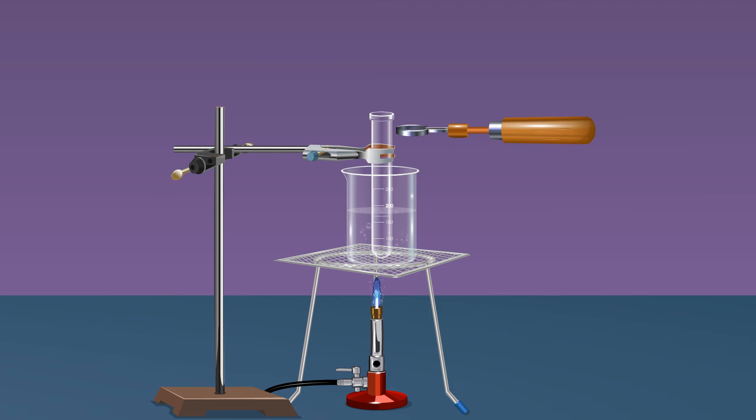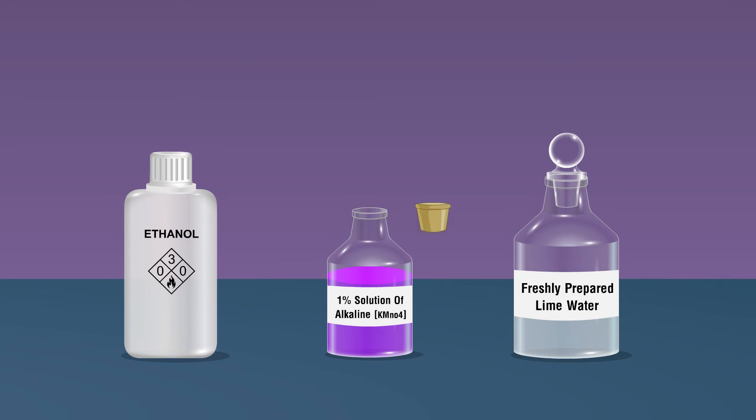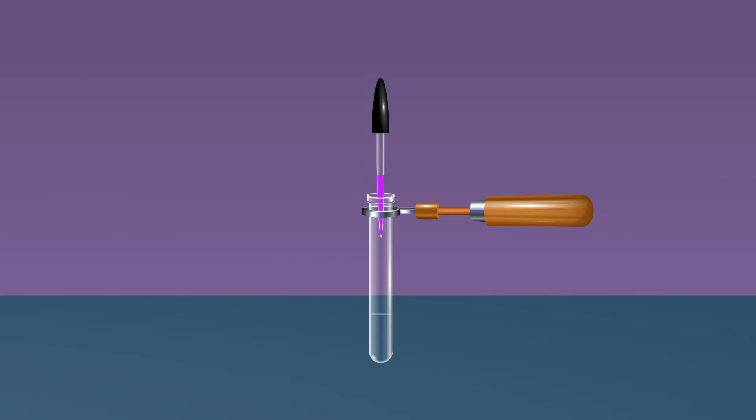Unclamp the boiling tube from the stand and use a boiling tube holder to hold the boiling tube. Take alkaline KMnO4 solution using a dropper to the boiling tube. Add 2 or 3 drops of 1% alkaline KMnO4 solution. The purple color gets decolorized.